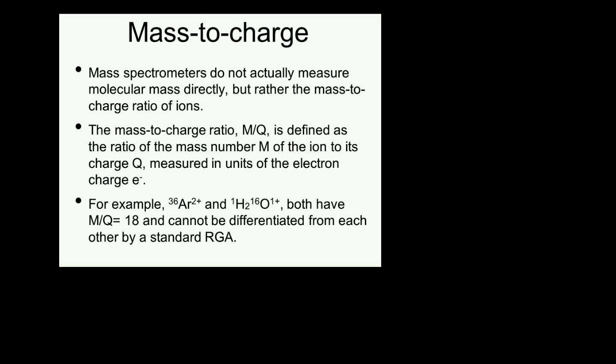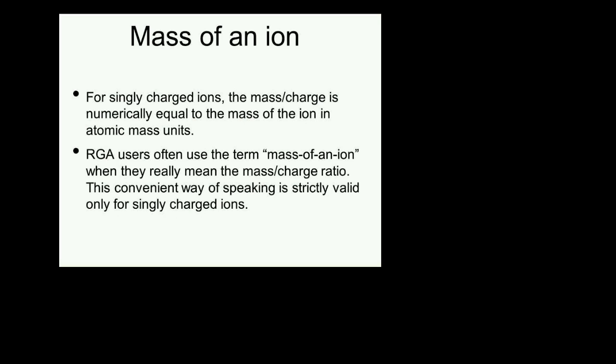So it's very important, and they cannot be differentiated from each other by a standard RGA. It's very important to understand that only for singly charged ions, the mass-to-charge ratio is numerically equal to the mass of the ion in atomic mass units.